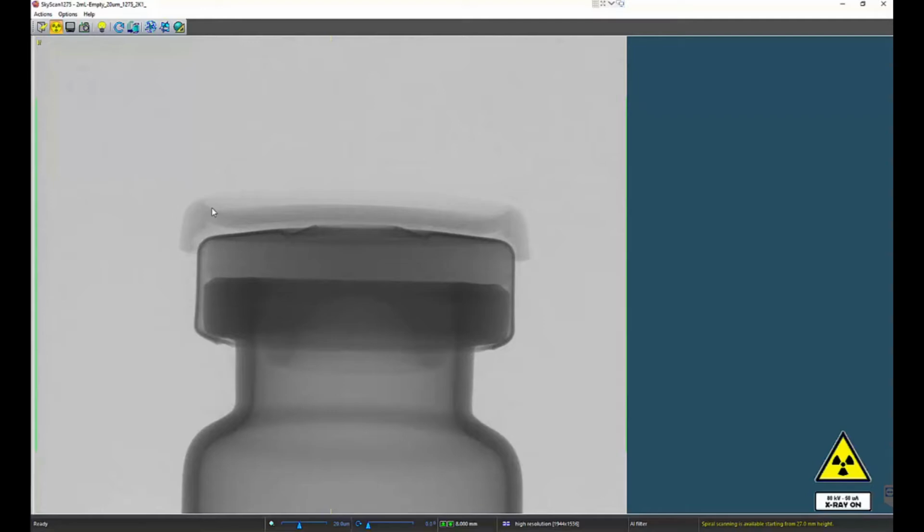So this is a great way to try and ensure that your results aren't changed by scanning parameter changes in the middle of a study, because every sample will be scanned like the one before it, following the same main scan settings.